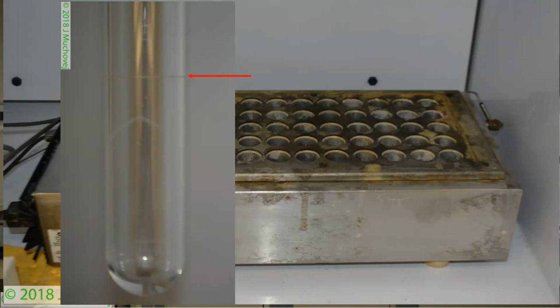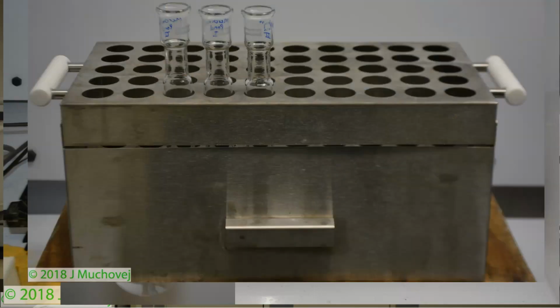You can see here there's a tube that we use. It's got a little line on it. This is about 1/3 of the way up. This is the line where you would add your acid to it. The sample is normally added as a small dry powder. Then you would put it in and it basically would boil. This is what they look like in this specific holder for these particular types of tubes.